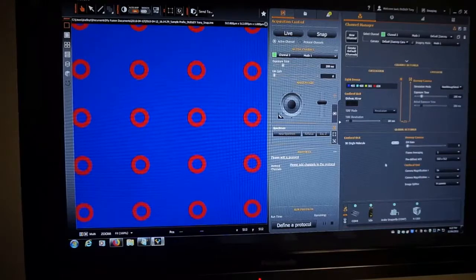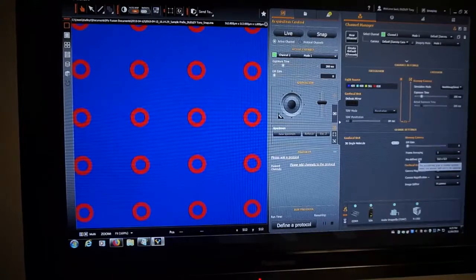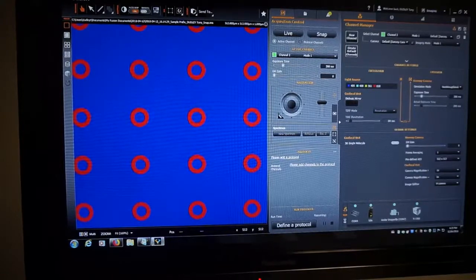They'll be where you want them to be. And I would say, you know, remove the things you don't want here, right? If you don't think you're going to be doing frame averaging or predefined areas of interest, go hide them in the advanced settings so that they don't clutter up this window. Okay?